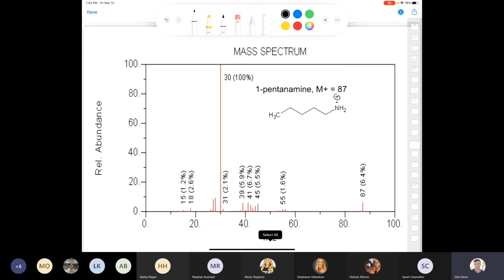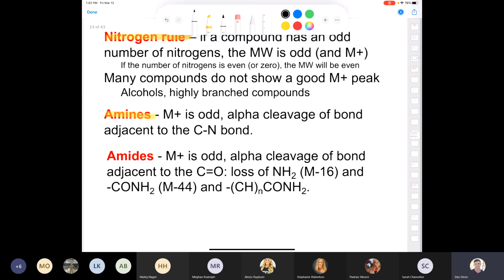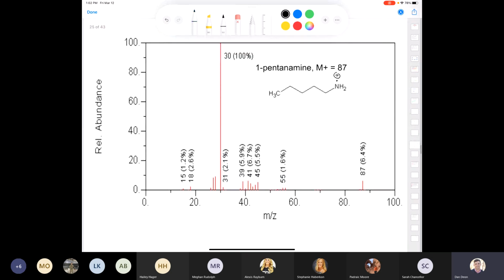And then that radical cation can undergo cleavage adjacent to that carbon-nitrogen bond, right? It can undergo the alpha cleavage. Let me go back here. We have our alpha carbon and we have our beta carbon here. Now, again, I'm not expecting you to draw radical mechanisms on here at all, but if you're the kind of person that's got an inquiring mind, you might want to practice that.